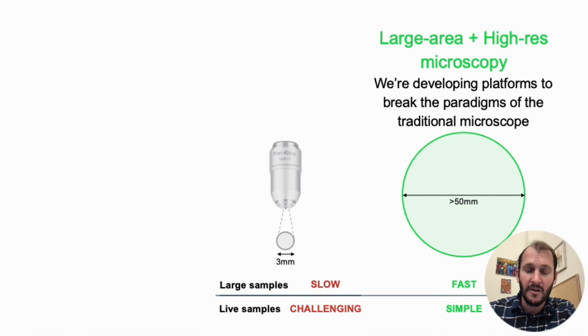So a lot of our research in my lab, and what we'll talk about here, focuses on the design of large area, high resolution microscopes. So we're really trying to allow researchers and others in industry to see extremely large areas rapidly and efficiently, which allows them to scan across many samples quickly and allows them to complete new studies with living specimens.